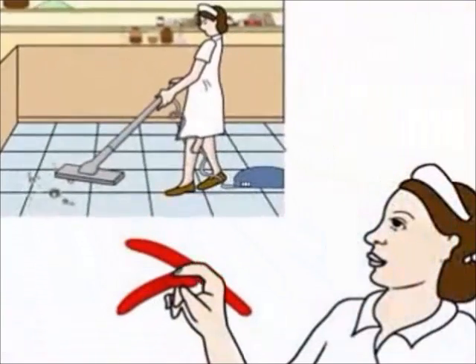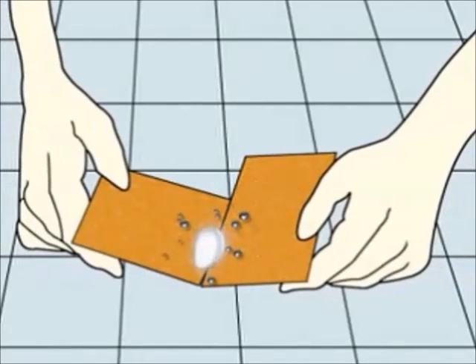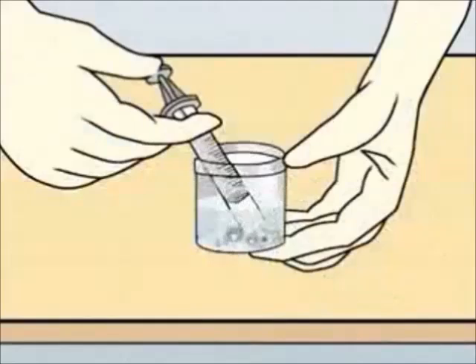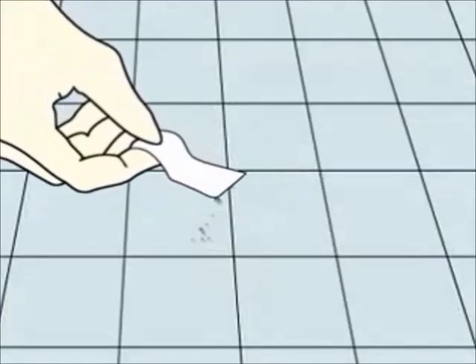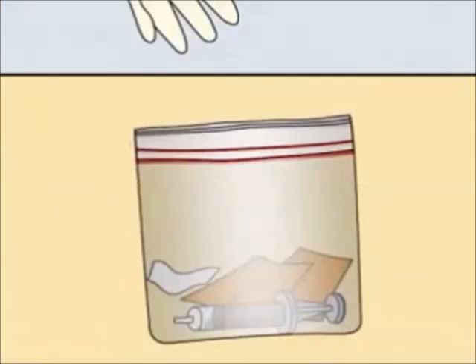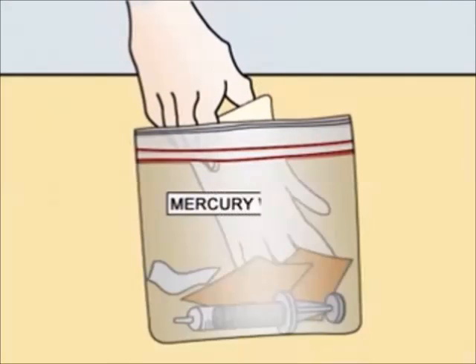Push the mercury beads together with the cardboard sheets, then use a syringe to suck the mercury. Carefully release the mercury inside the container of water and seal it. Pick up the remaining mercury with a surgical tape, then place the contaminated tape, syringe, gloves, and the cardboard in a plastic bag.